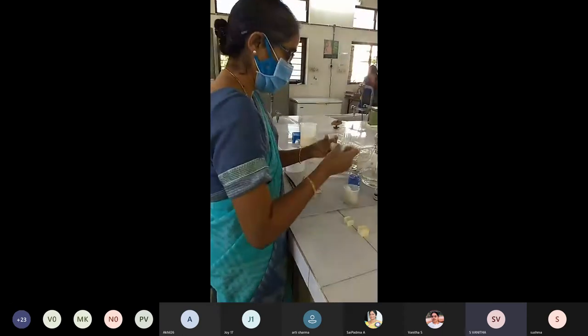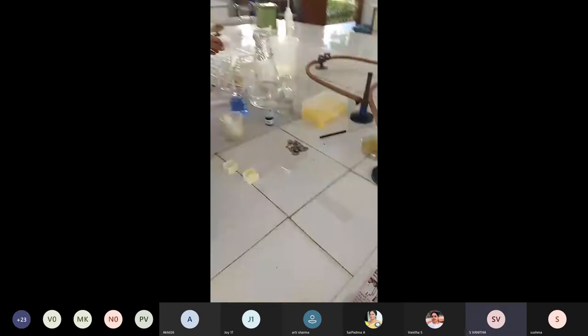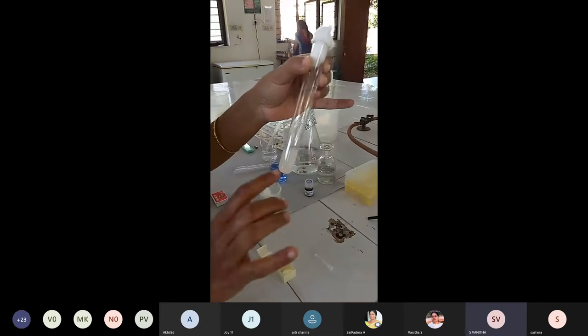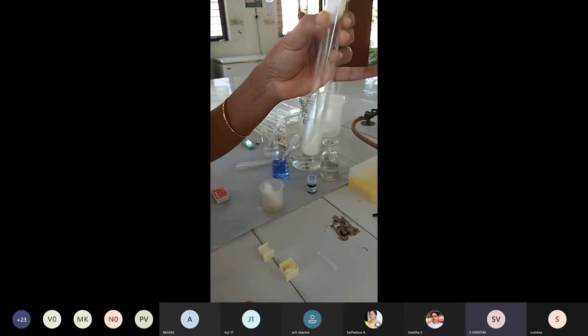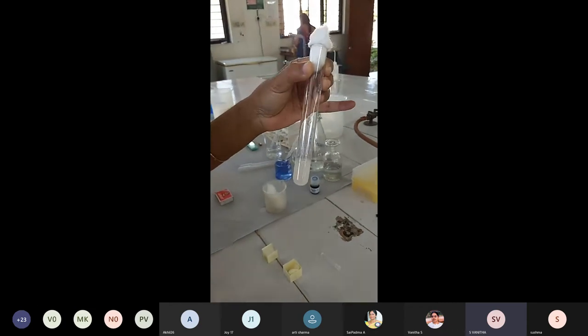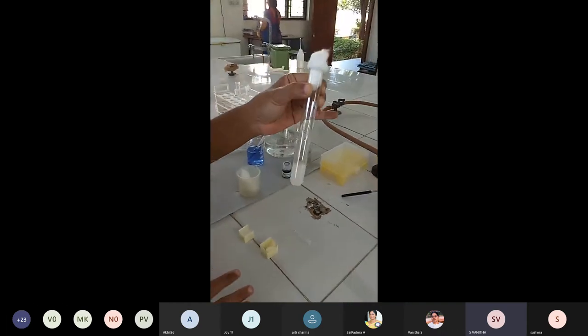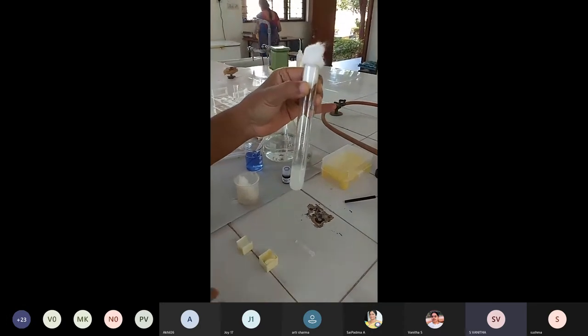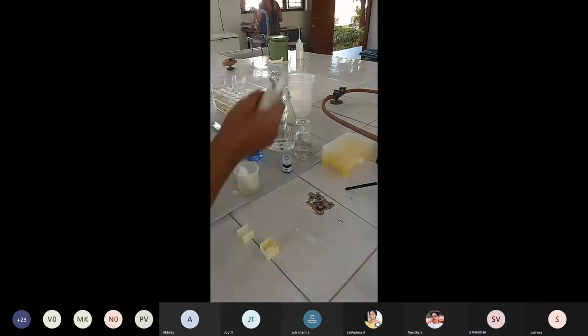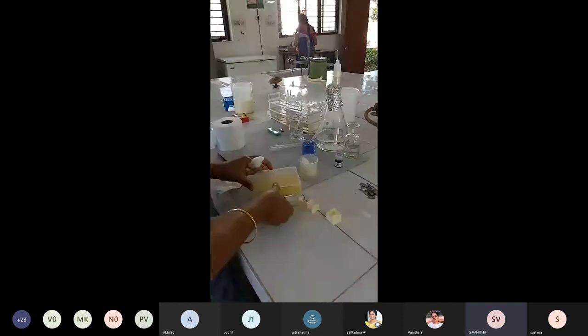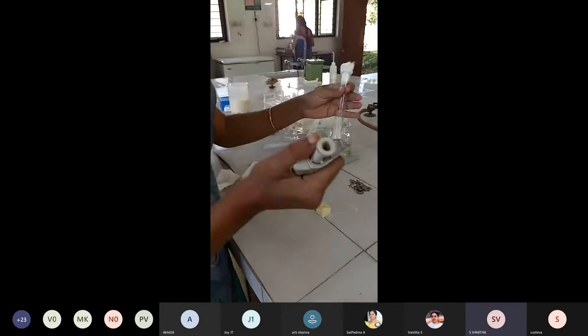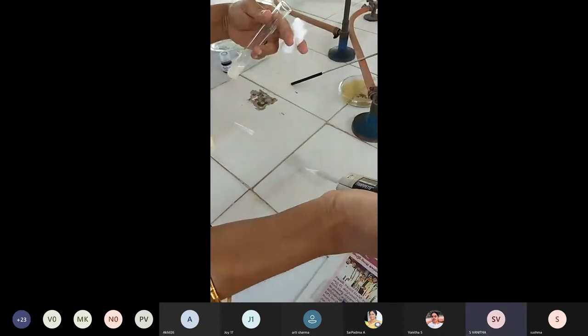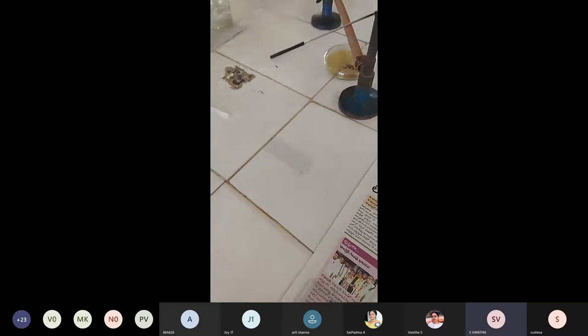This is the sample. What we have done is we have taken the Baker's yeast and we have inoculated it in the distilled water. You can see how turbid it is. We will just take few drops from this one and place it on center of the slide. We are not adding any mounting agent. Just in the water. The sample is brought and we will put the coverslip and focus it under the microscope. Just mix the first one and just take a small drop and place it in the center.